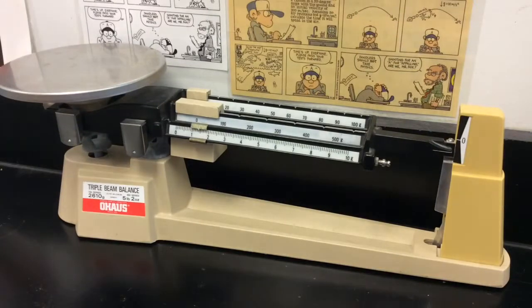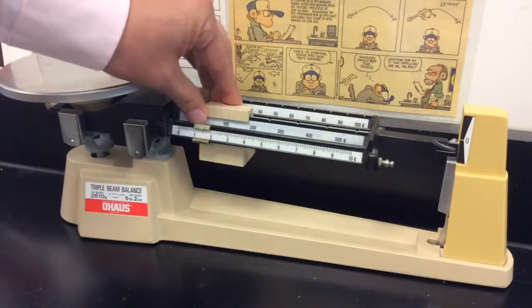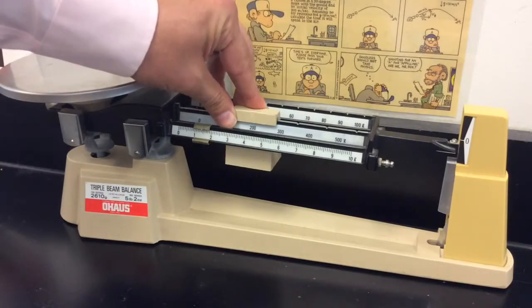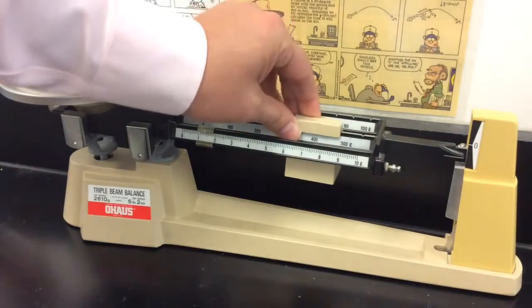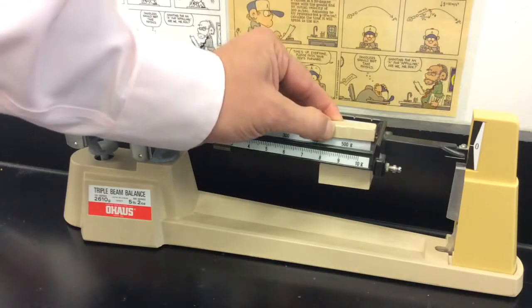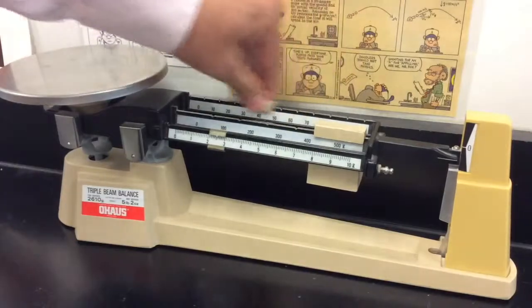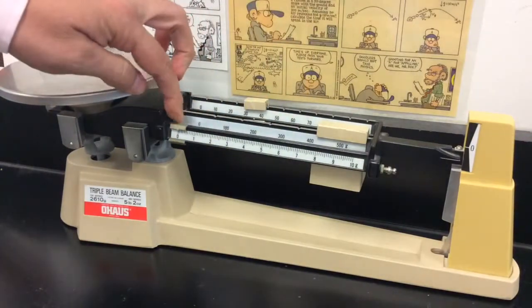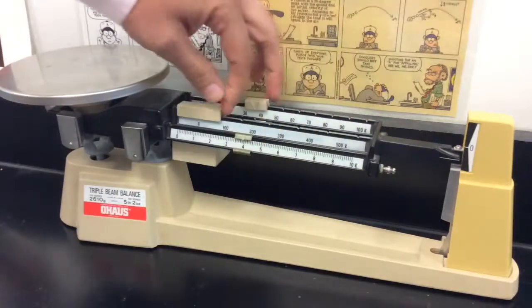This is a triple beam balance. It's used to measure mass. It's pretty easy but there are some tricks to it. First, you have to make sure that the 100 gram slider is always in a slot. It's pretty easy to slide it past the 500 gram slot and forget and put it between slots. Same thing with the 10 gram slider, but you can put the smallest one anywhere you want.